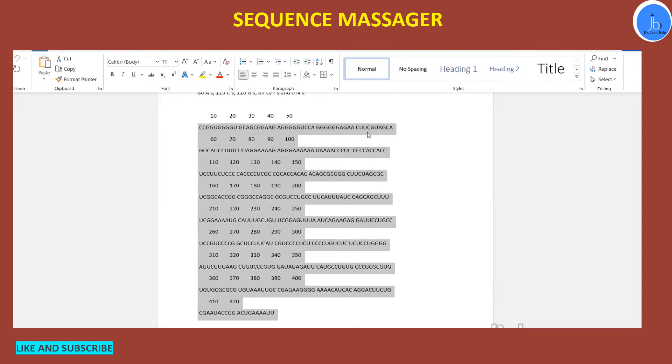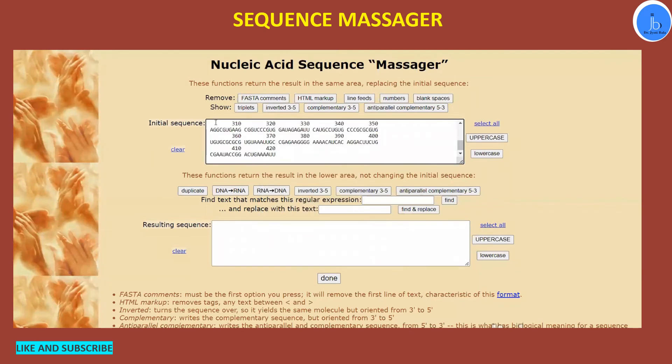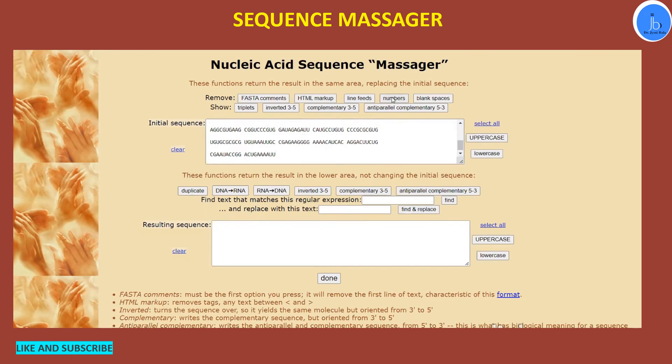So what we can do is just go to Sequence Massager, paste your sequences, and if you want to remove these numbers and spaces, then we have to go to the Remove section and we have to click Numbers. We can remove the blank spaces and the line feeds because we don't want them for the analysis.